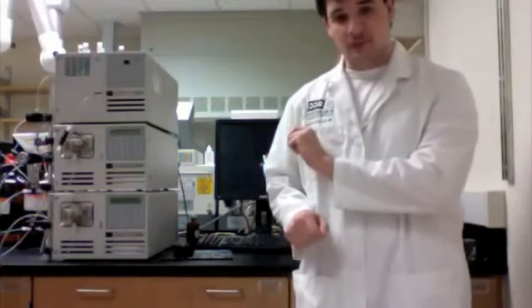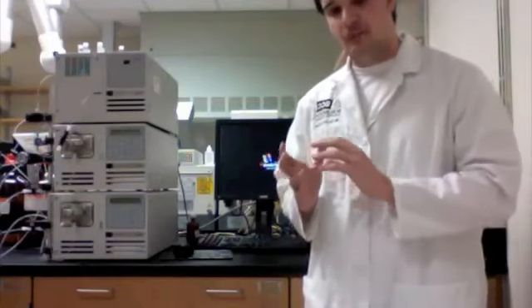Now what the HPLC does is it's very similar to the GC, except where the GC vaporizes your liquid into a gas, the HPLC keeps everything in a liquid mobile phase. Once you put your sample onto the machine, the liquid mobile phase comes and picks up your sample and pushes it through a column packed with a stationary phase where it's separated into its components.